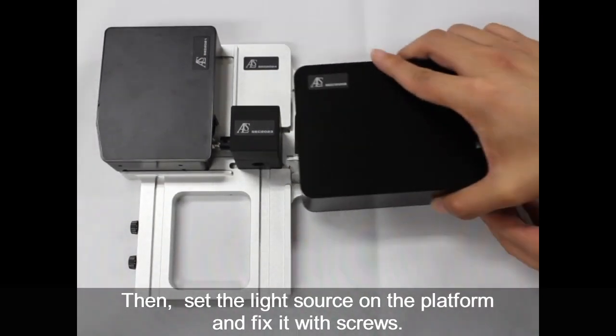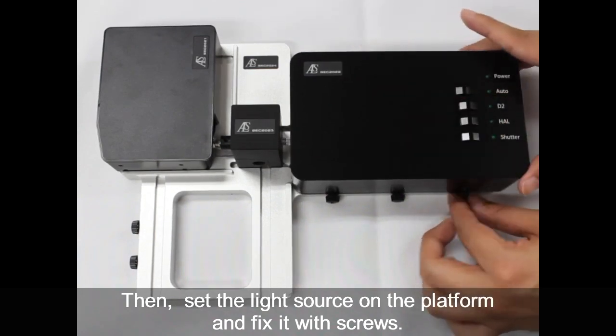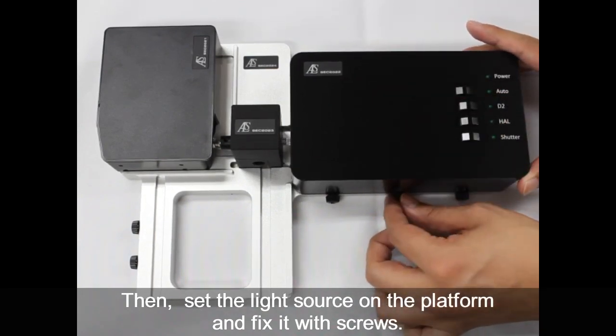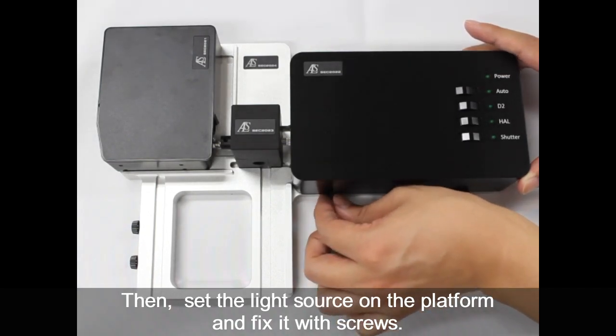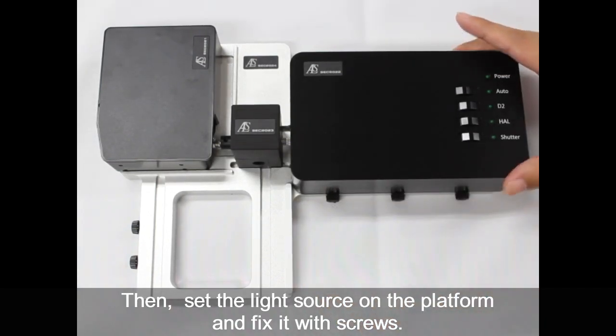Next, set the light source on the platform and also tighten the screws attached to the platform to fix the light source. This is the basic setting method.